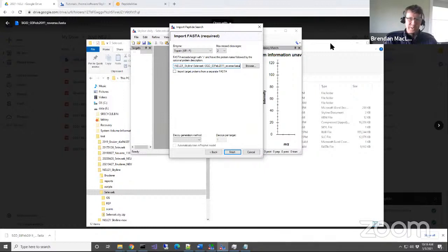Although there is also a quick, short way of getting the template to run Skyline Batch. As soon as we have the template, we're going to switch over to Skyline Batch land on how we set up processing for this. We're going to discuss what we want to do there.